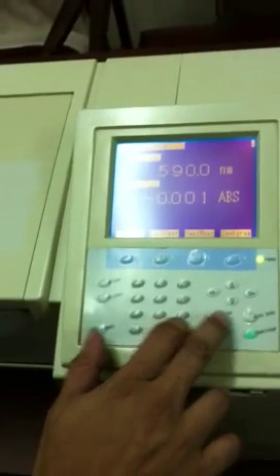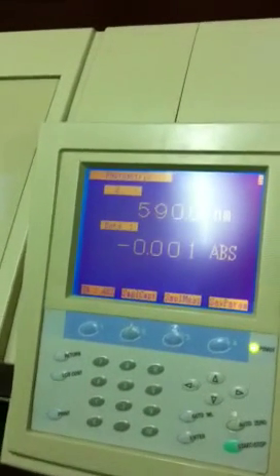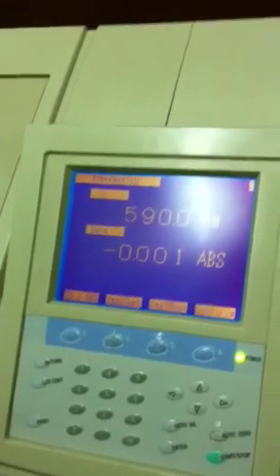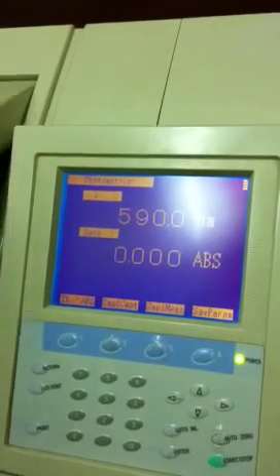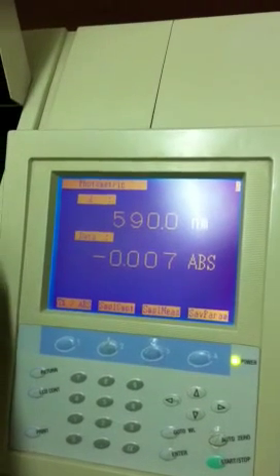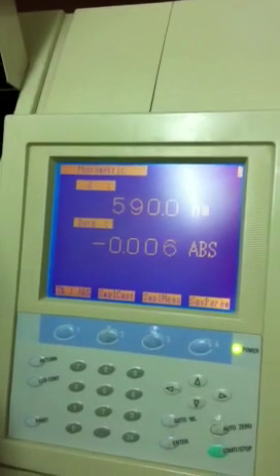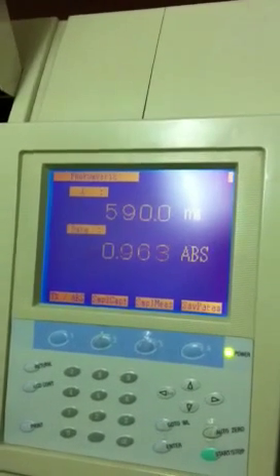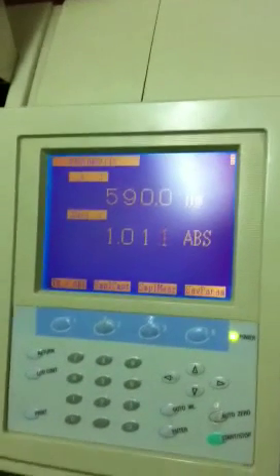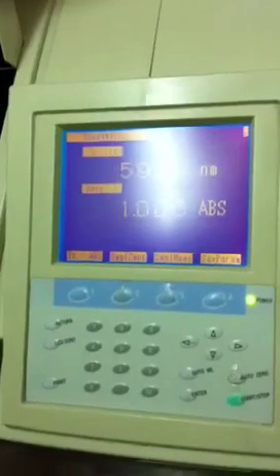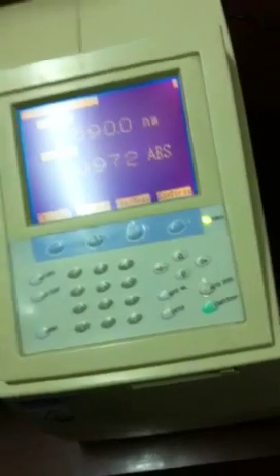And that's pretty much it. Well the best feature about this unit is the scanning option, it have a full range scanning from 190 nm to 1100 nm and that's a very important feature and you can also print that out directly to a printer.